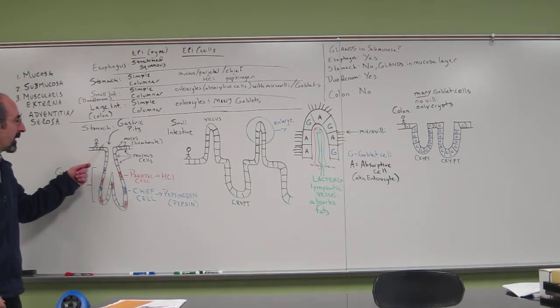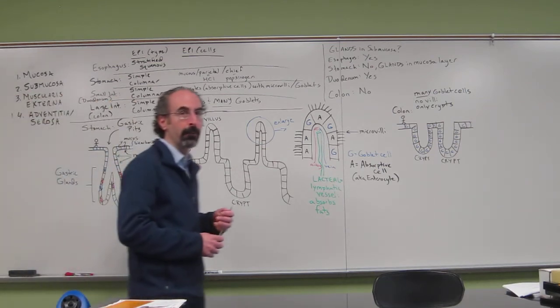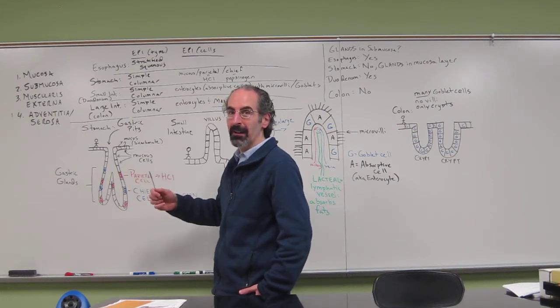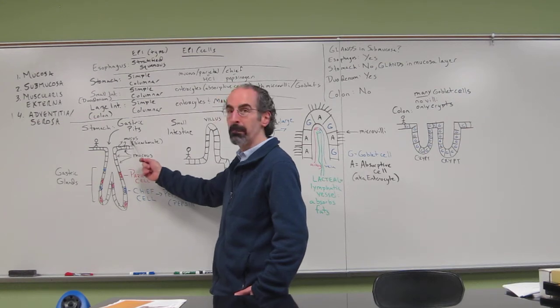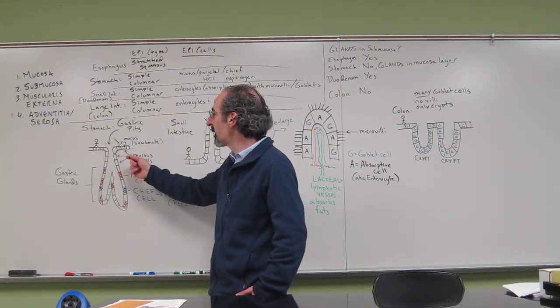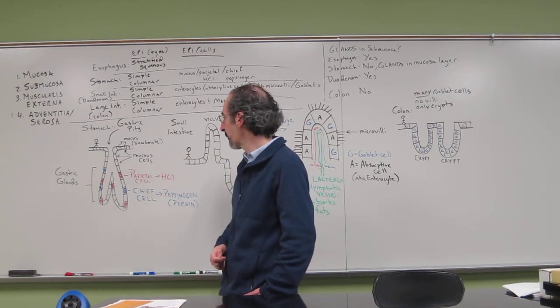So in this case, there is a gastric pit, and there are a number of cells that make up the pit and the lining of the pit and the glands and so forth, but we want you to look for 3 of them. The bulk of the cells that make up the pit and the regions of the pit, which are outlined more in the text, are called mucus cells. What they secrete is mucus, really a secretion of water and bicarbonate, which helps reduce the acidity of what's being secreted by the parietal cells from the stomach.